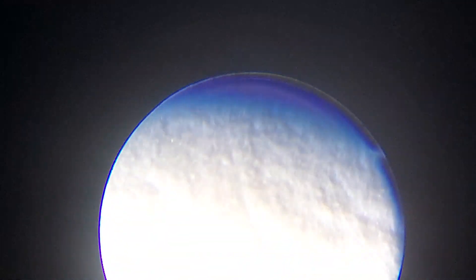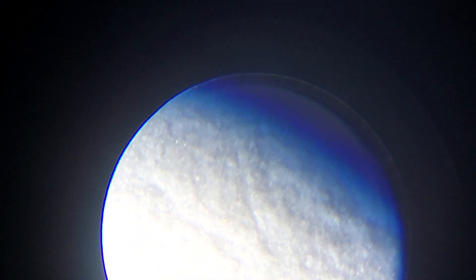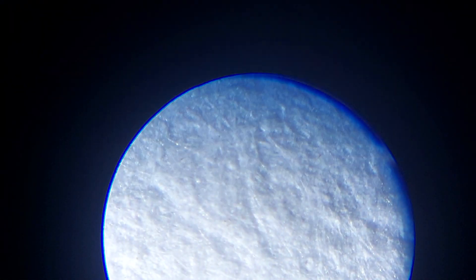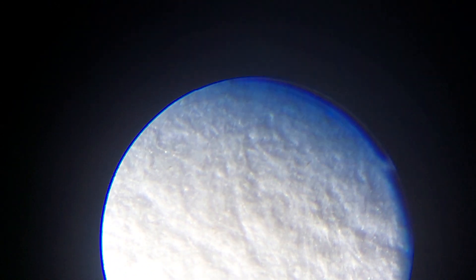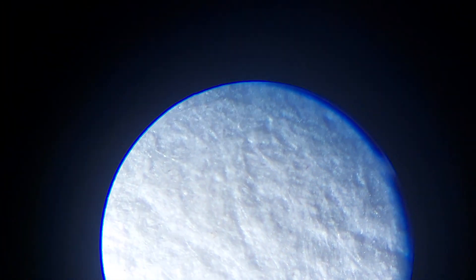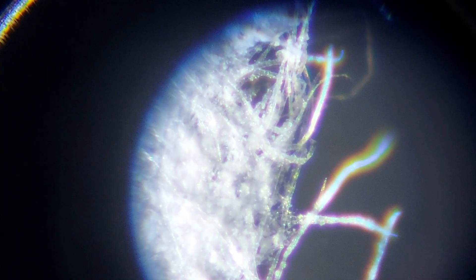As you can see, the small cellulosic structure there — let me focus it. It actually moves around pretty much, so I have to keep my hands still. This is the cellulosic structure at 60x, and I am focusing with my left hand. Let me show you more at 120x.